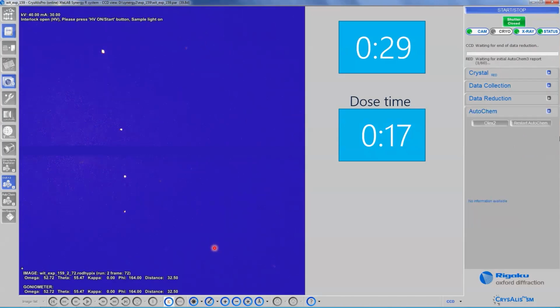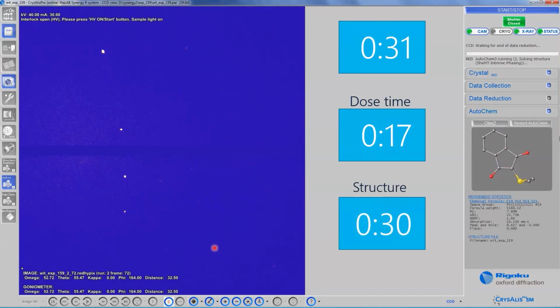And once the whole thing is done, then hopefully you get a crystal structure or a good enough model to go on and finish obtaining the crystal structure of your compound. This model that you see on the right-hand side can be whole, meaning you've already got all the non-hydrogen atoms of your molecule. It can also be partial, not to worry at all. What crystallographers do is refine whatever model they currently have, look again at the electron density map, or in this case, the residual electron density map. Hopefully there are a few more maxima in that map that correspond to atoms that have not been assigned yet. So they enter those atoms, refine the model again, and so on and so forth, building up their molecule little by little, step by step, all the way up until they see solvent molecules, if there are any, and even hydrogen atoms.